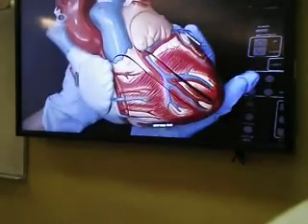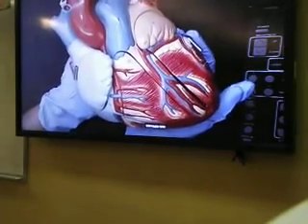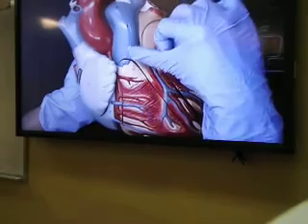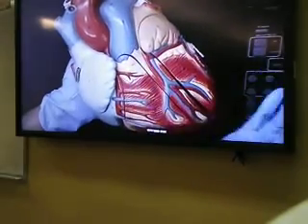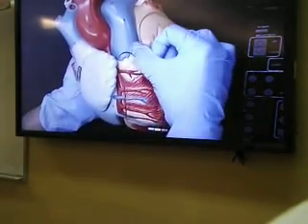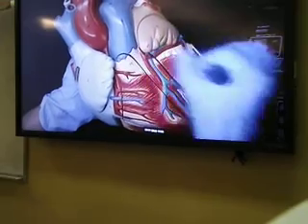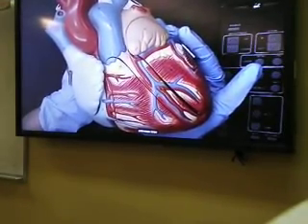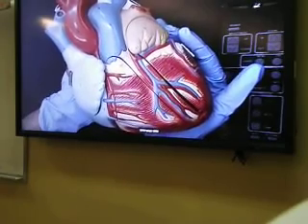We will learn which arteries each of those are, but they are coming from the most superior region of the heart onto the anterior aspect, and that superior region is the base of the heart. So sometimes that way also we understand that we are looking at the anterior or ventral surface of the heart.